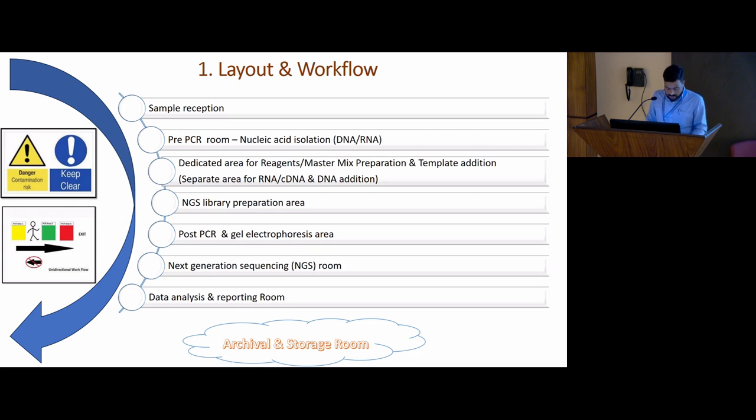Then the next generation sequencing room is an area where you have to keep access to this instrument to a minimum. Very few trained persons can attend this area, otherwise there is an issue of contamination.